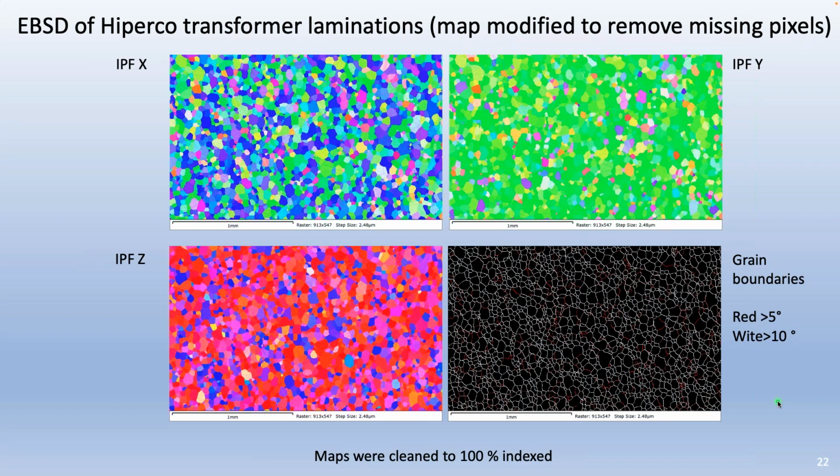One thing that I've done in the past, we had an issue with stainless steel and induced martensite from polishing versus real martensite or BCC phase from the actual sample. One thing you can do is try electropolishing. I don't think that introduces as much question for sample prep as does some of the other mechanical techniques.